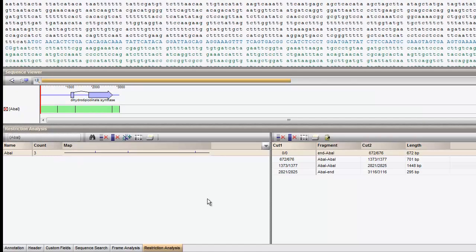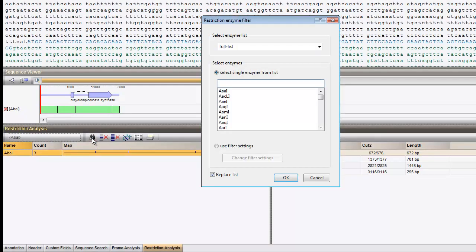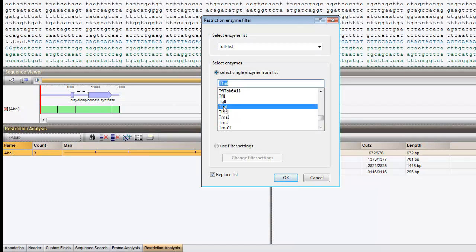Let's do the same for the second enzyme. I choose ThaI and I uncheck Replace List option.